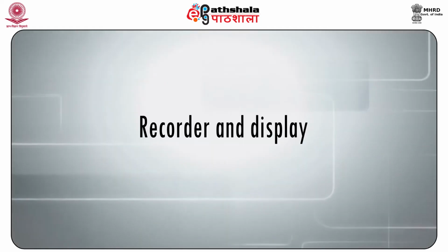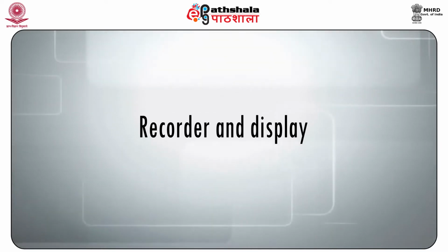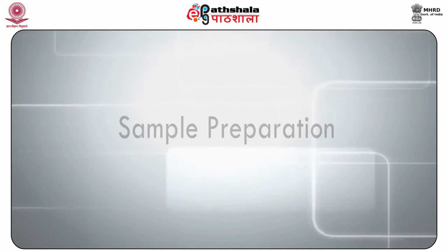Looking at the fifth component, that is the recorder and the display. The recorder records the data obtained from the detector and the display unit reads out this data. Displays are also called readout devices.